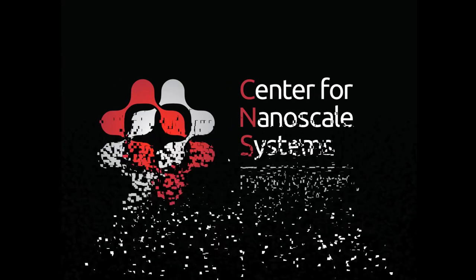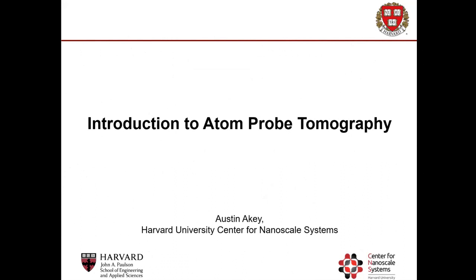There we go. Wonderful. All right, so today we are going to be doing an introductory lecture on Atom Probe Tomography. This is intended for people who have little to no experience with the technique and are curious about it, what it is, how it works, and what it can tell them.